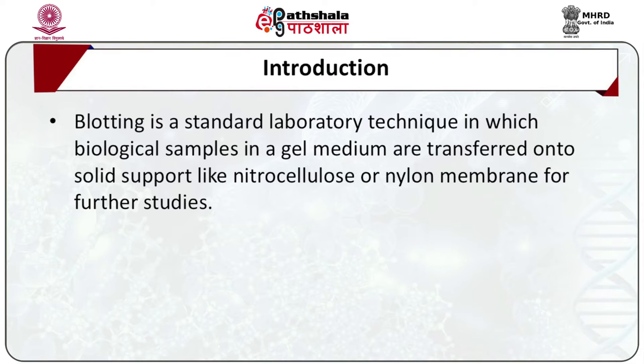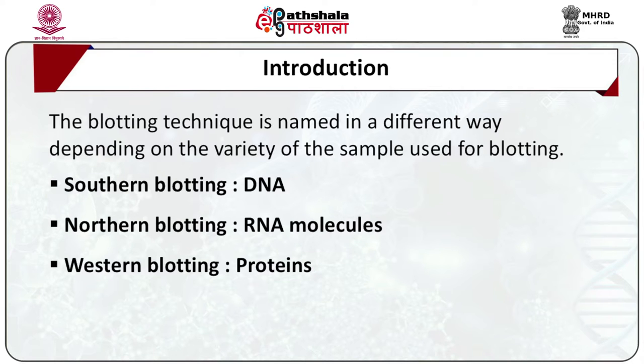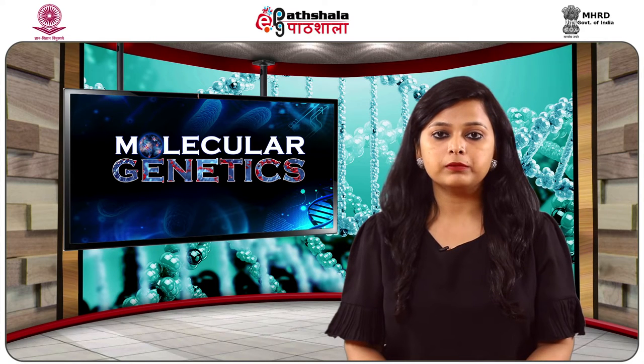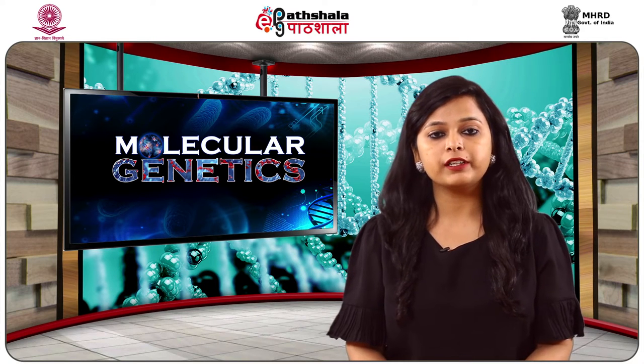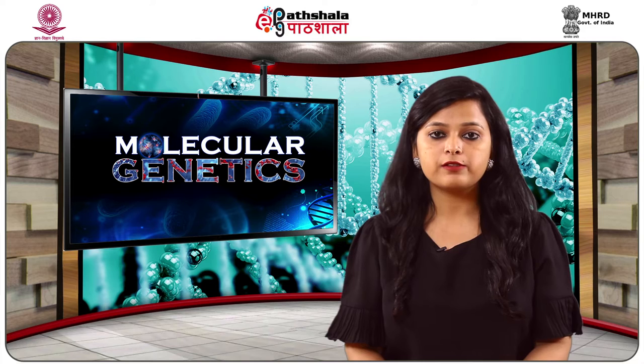Blotting is a standard laboratory technique in which biological samples in a gel medium are transferred onto a solid support like nitrocellulose or nylon membrane for further studies. When the biological sample is DNA, the technique is called southern blot, named after the discoverer Edward Southern in 1975. The blotting technique is named differently depending on the variety of samples used. The northern blotting technique, which transfers RNA samples, was developed shortly thereafter, hence the name northern blotting. Similarly, the transfer of proteins was named western blotting.